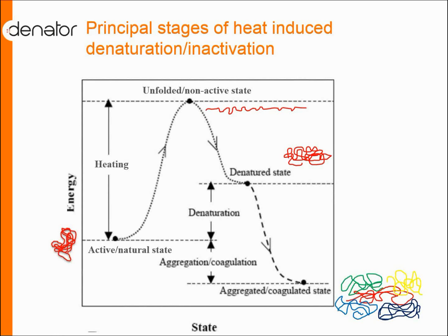the enzymes will unfold into a non-active state, and then the samples are removed from the instrument and allowed to cool down, and we have hydrophobic collapse of the proteins. They form a new 3D structure, however, in a denatured state, which is a non-active state. And as this happens in the cell, where you have a really high protein concentration, you will also end up in an aggregate, coagulated state together with lots of other proteins. Again, a non-active state. So this is what happens on a molecular level in the tissue or in the sample which is being stabilized.